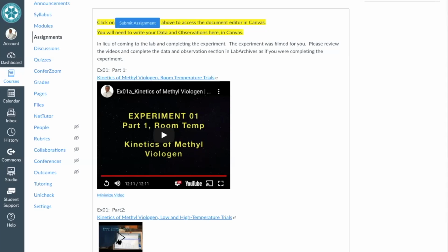But let's say we do it at 16 degrees. If you remove that cuvette from that cool water and put it into the spectral vis, it'll start warming up. It's going to go from 16 to 17, back to room temperature. You can't do that, because then the rate's going to change. So you need to take that cuvette in that cool water bath, put it into the colorimeter for some time, maybe a minute, record the absorbance, and then take it out and put it back in the solution so that you're maintaining that 16 degrees constant temperature.